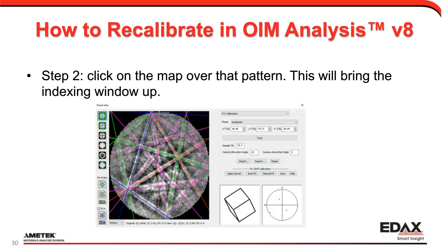We need to understand this value so we know what area I should be looking at in the Kikuchi sphere and in the diffraction sphere, and how I should look at my data. If that scaling factor is way off, you'll see it. Everything looks either squished or blown up too much. That's why the Z star tends to be the most important one.